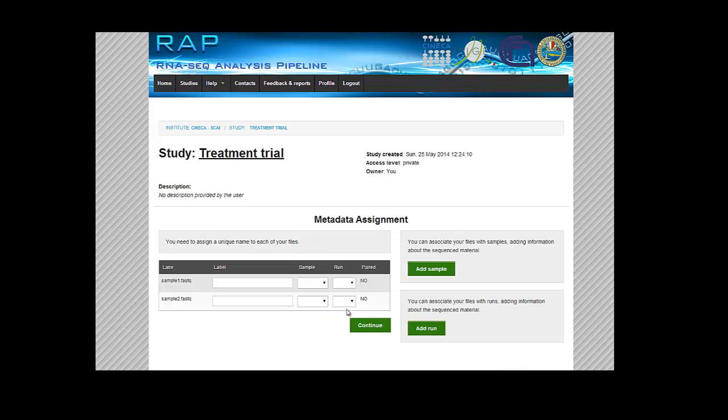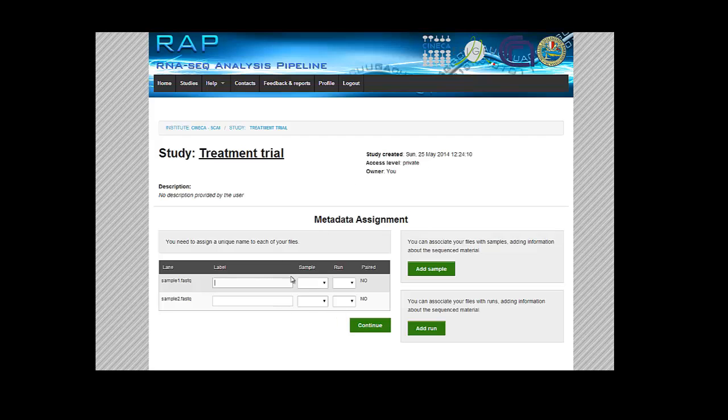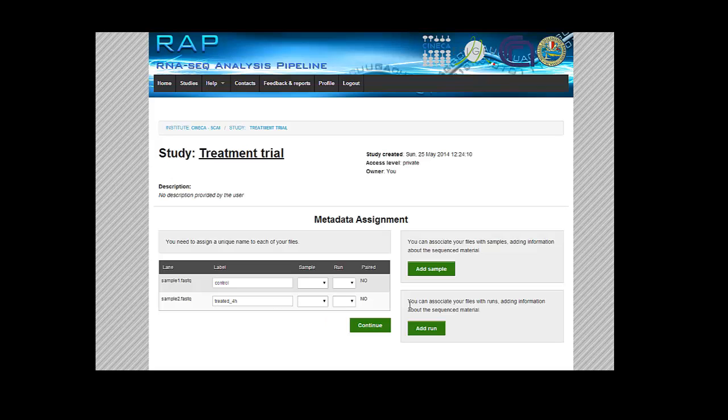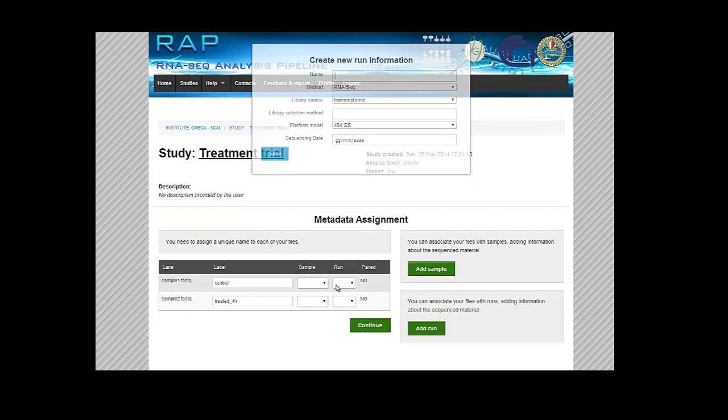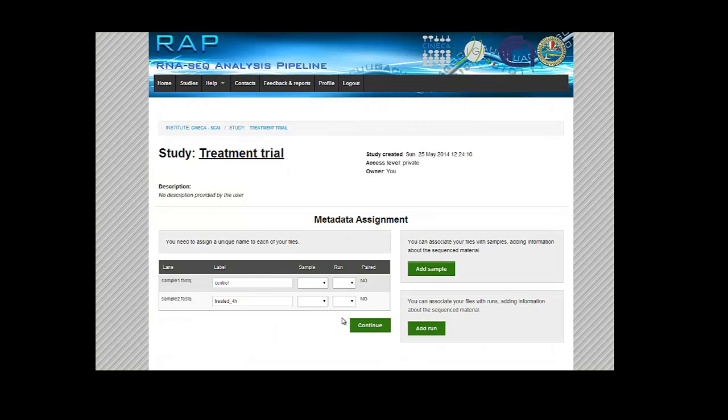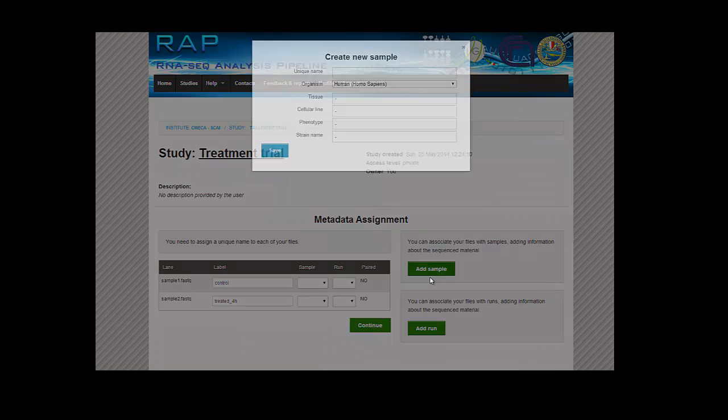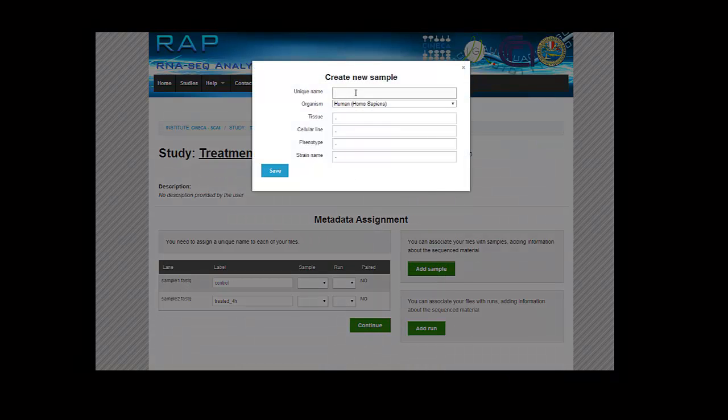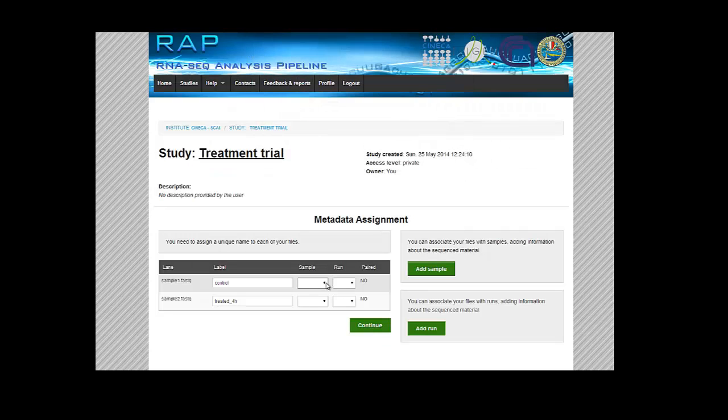And the next step, when we click on the continue button, is the metadata assignment. We can just limit ourselves to giving a name to the files, or we can assign sample and run information to each of our files. You can add a sample with all the information required, save it, and then select it from the sample select element.